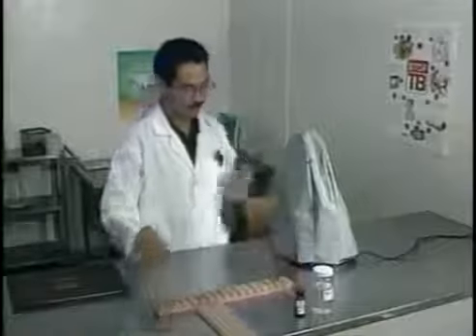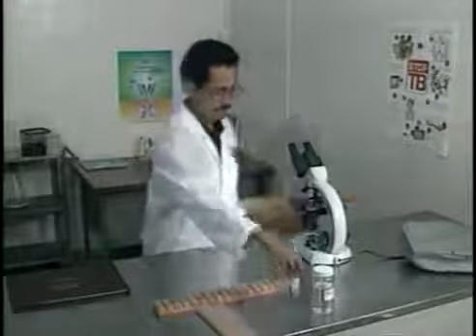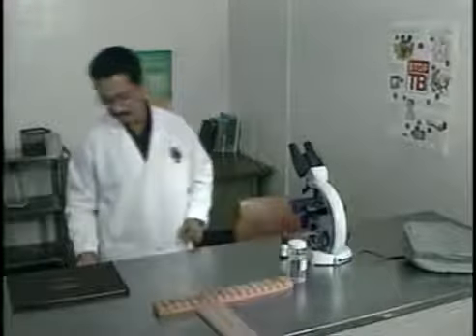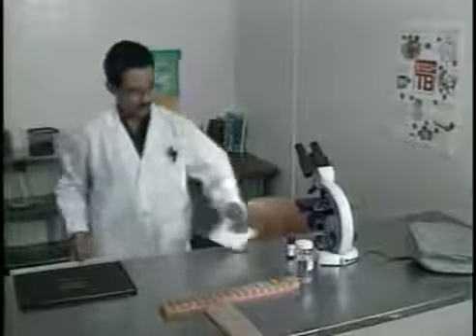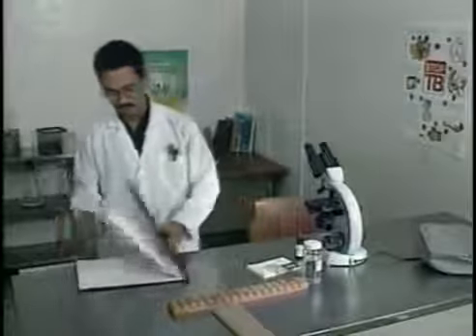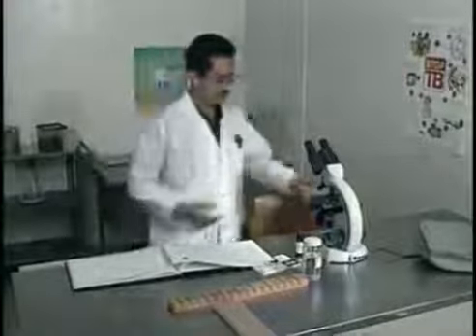Arrange the following supplies next to the microscope: a bottle of immersion oil, organic solvent, lens paper, laboratory register, and a slide box for storage.